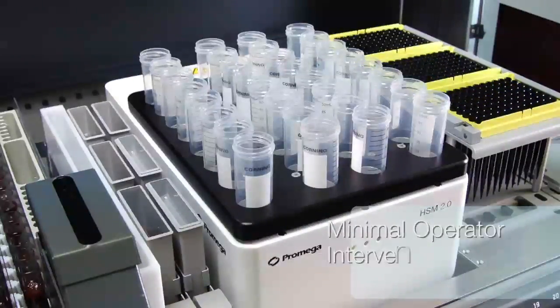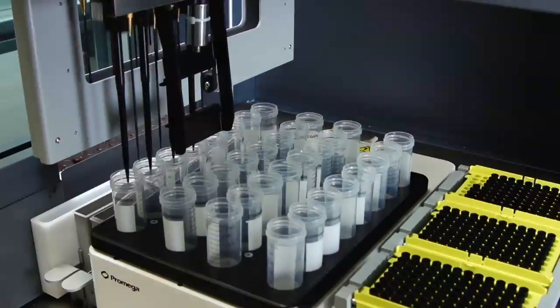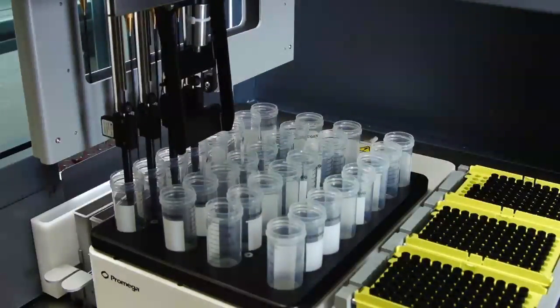Once the instrument is prepared, minimal operator intervention is required. First, the instrument transfers the blood samples, if required.